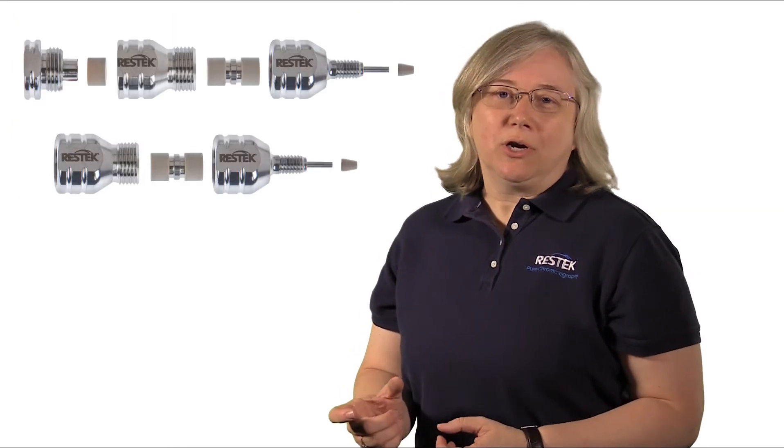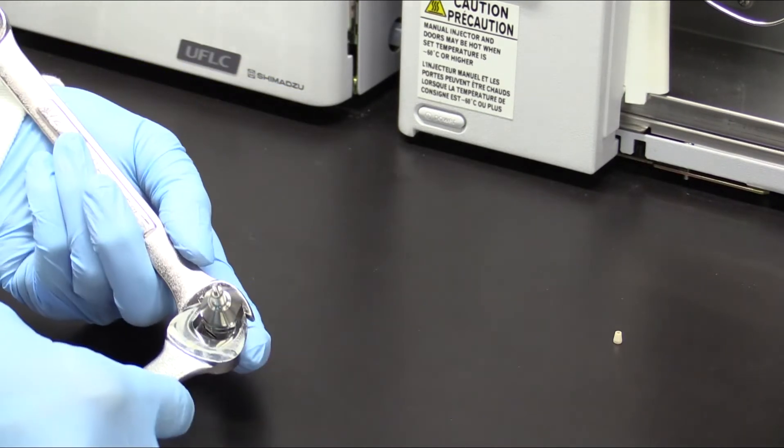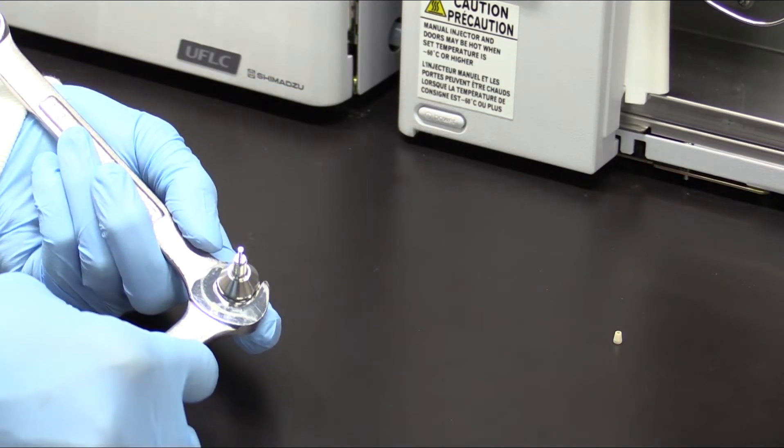When you're using a Level 2 or Level 3 system, where a guard cartridge is installed, you first disassemble the holder, drop in the cartridge, tighten by hand until it's snug, and then use a pair of wrenches to complete the tightening.